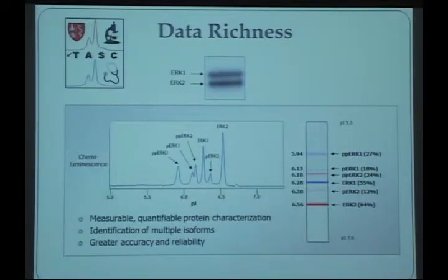Sometimes in Western blot, antibodies are a little dirty, no? And how can you distinguish the real band from, I don't know, signal that is non-specific? Right, so that's a really good question, and actually Dr. Fan will address that. I don't want to elaborate on this too much, but this is a very important question that we deal with every day. So I'll let Dr. Fan answer it when we go on.